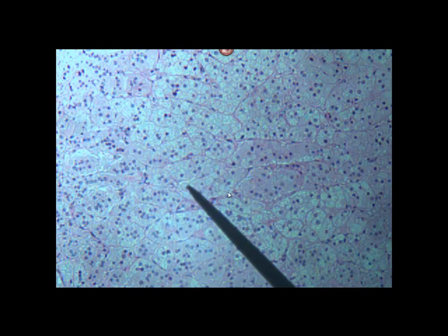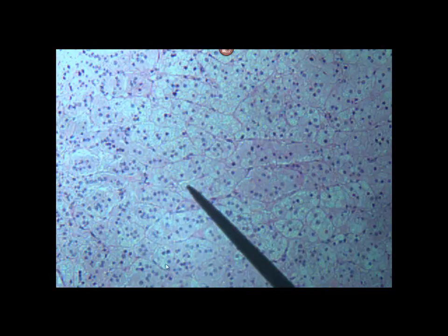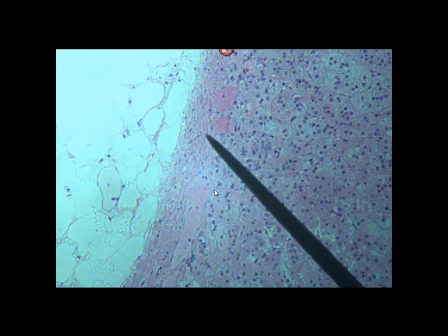If you kept going further right, you'd come across the middle part of this gland with this big white area, and it's kind of got a little bit darker red in here. This is the adrenal medulla, and yes, I'll be using these pictures on your quiz, so you can go through and get a good look at all of them. If you were to keep going on the other side, you would come across the cortex area and another capsule.